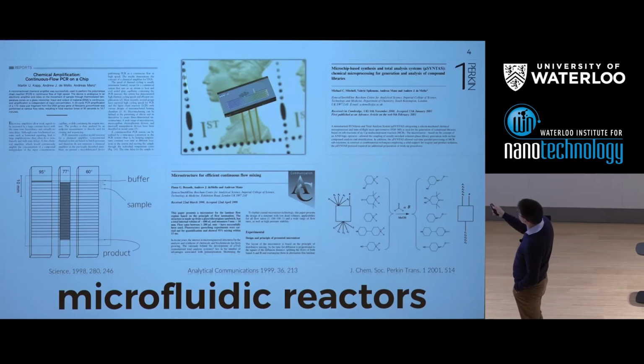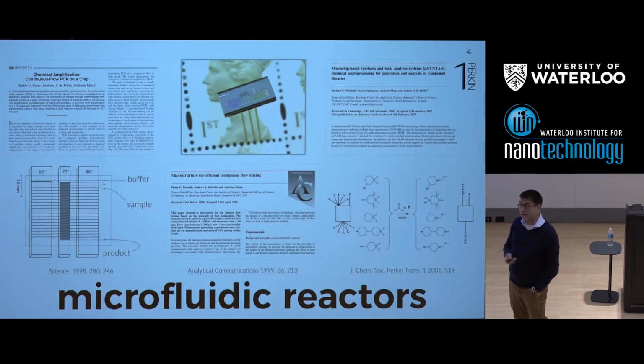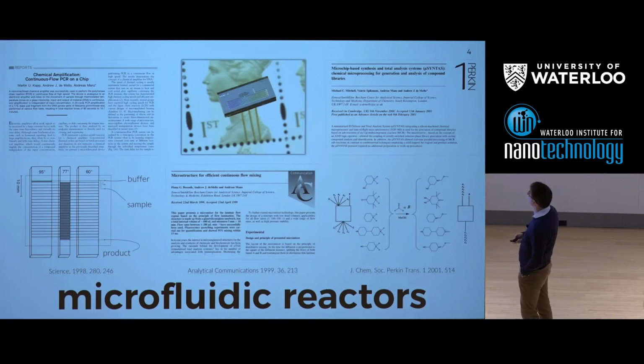We've just seen this. This is a very simple 3-layer device, or 2-fluidic layer device, which allows us to mix fluids using the ideas of parallel lamination and allows us to access mixing times on the millisecond time scale. Once we were able to optimize this design, we could then apply it to useful and relevant small molecule chemistries.